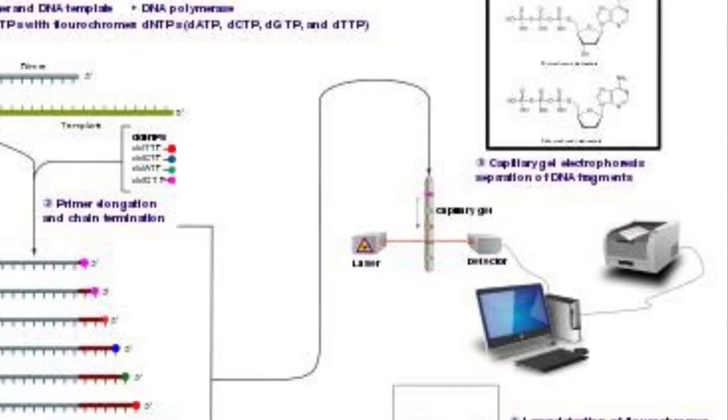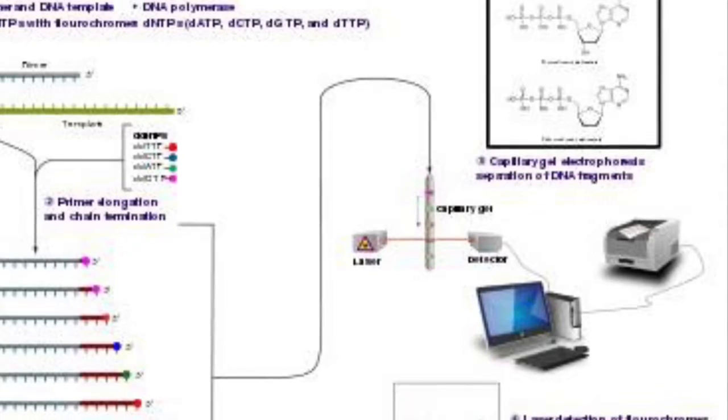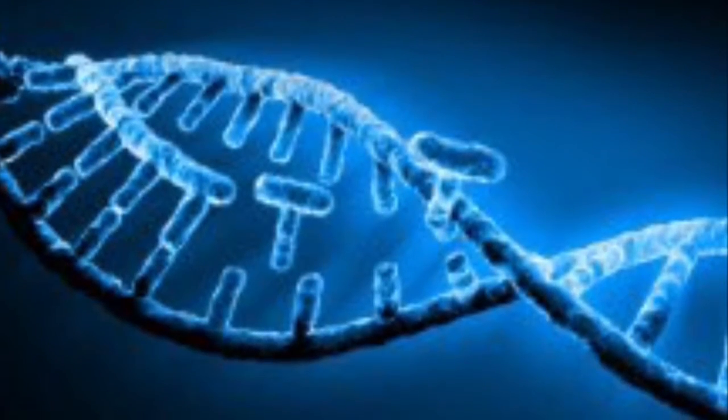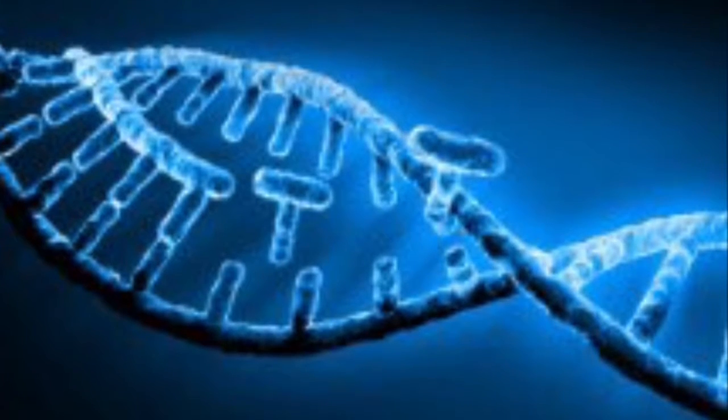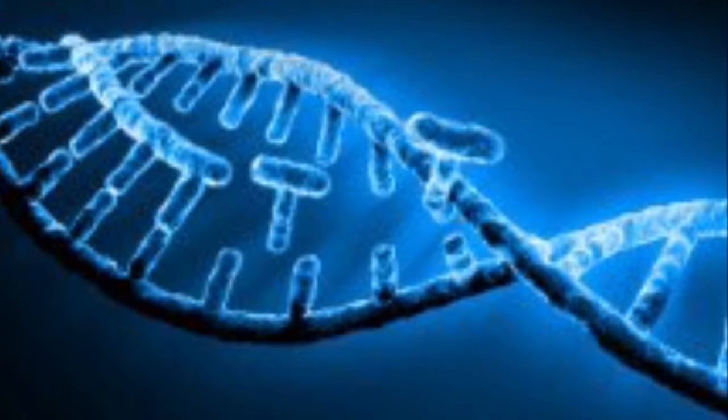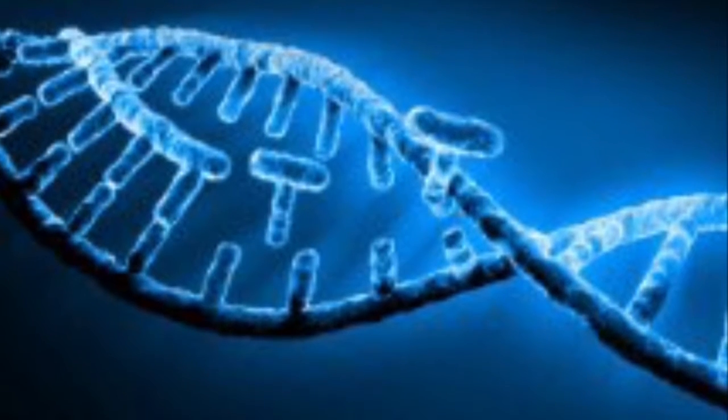The DNA sample is going to be in a tube with the primer, the DNA polymerase, and the nucleotides. First, you have to heat the mixture to denature, or separate, the double-strand DNA. When you get the single strand, it cools to allow the primer to join it.